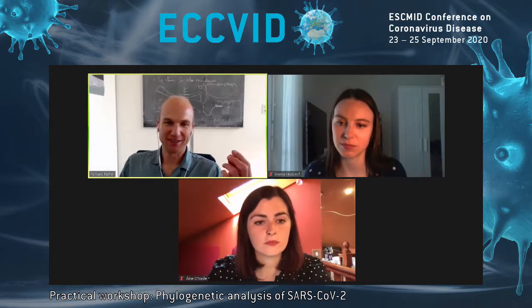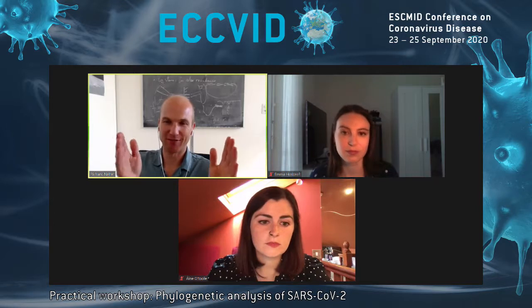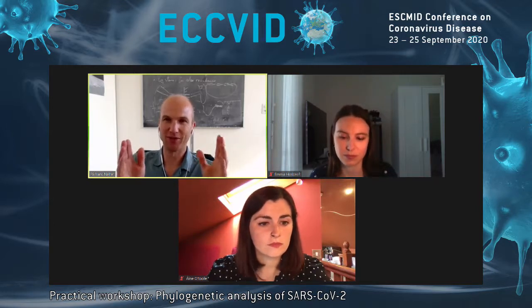Yeah, there's one question regarding recombinant samples. You typically find that if you took that sequence and split it in half, the first half of the sequence wants to be in one place of the tree, and the second half wants to be in another part of the tree, and that is a telltale sign of recombination. Of course, where in the sequence this breakpoint happens varies.